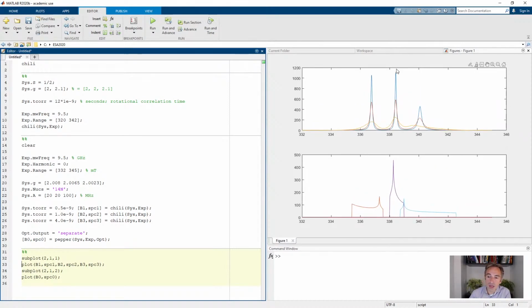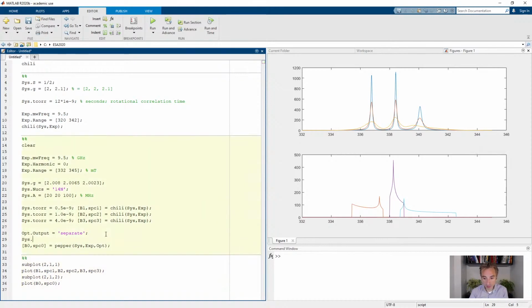So now you can see on the top the nitroxide absorption spectra, which is the integral of the CW EPR spectrum for 3 different motional regimes. And at the bottom, you see the rigid limit without any broadening. We should probably add a little bit of broadening here, just so it doesn't look so artificial. Let's see if 0.2 millitesla is too much. No, that's more reasonable.